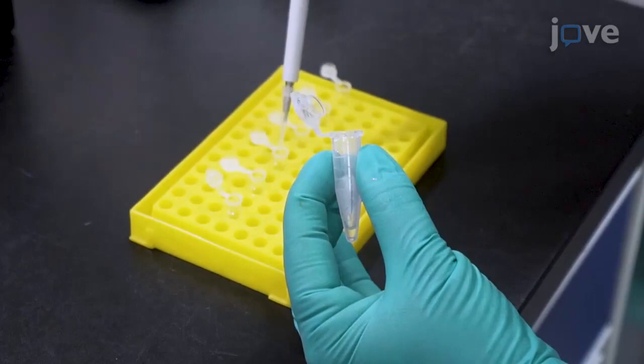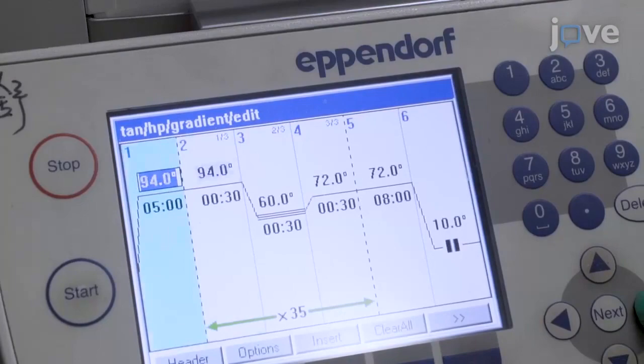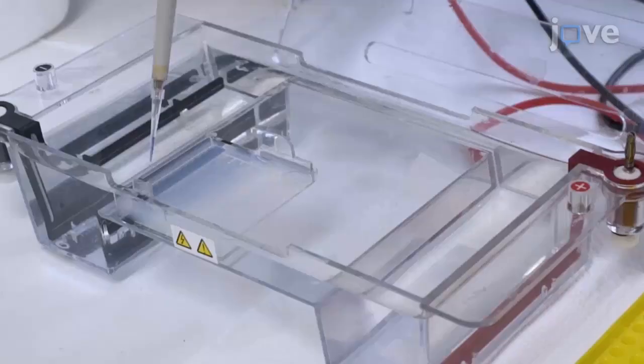Place the PCR tubes in a gradient-capable thermal block and adjust the heating program according to the manuscript to determine the optimal annealing temperature for each target fragment. Perform electrophoresis for the PCR product on 1% agarose gels to examine amplicons. Determine the optimal annealing temperature that enables specific amplification of the target fragment.